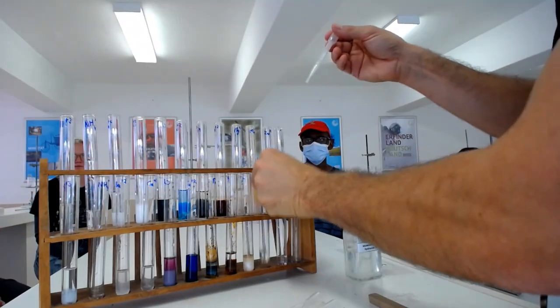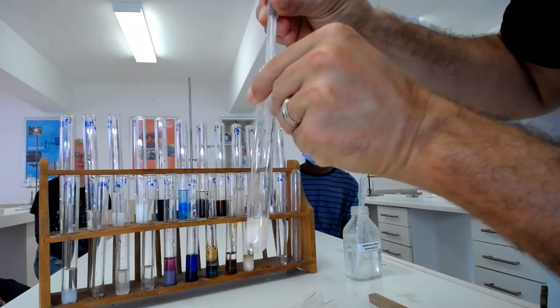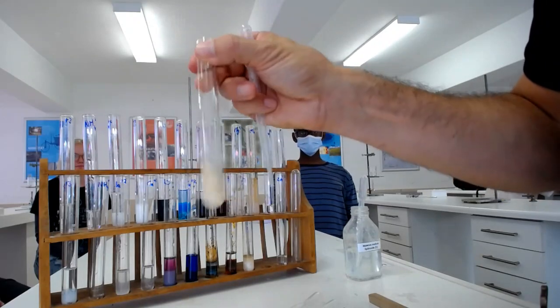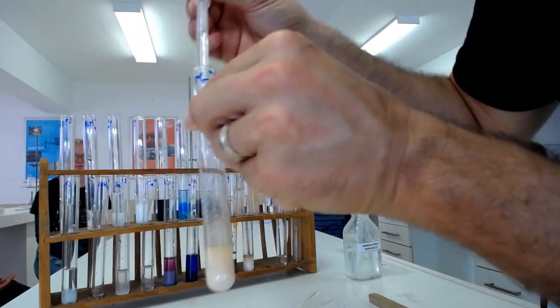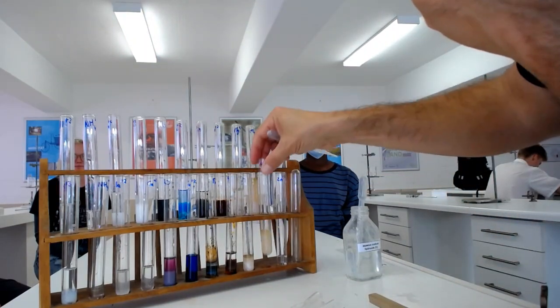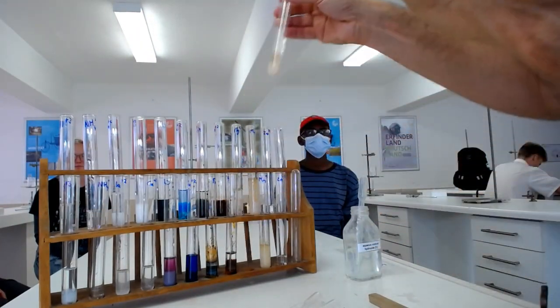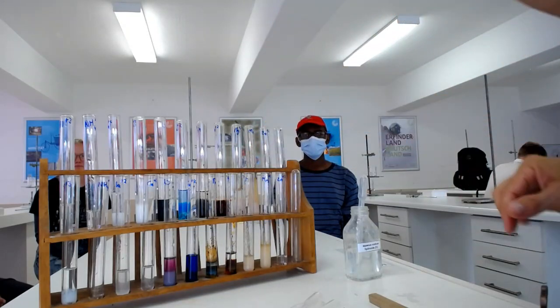Right, and what about ammonia? Let's see what happens in there. Same thing, a white precipitate that rapidly turns brown on top. What about excess ammonia? Also insoluble. So what's the thing about magnesium? I don't know. It says white precipitate insoluble in excess, which is technically true, but it's brown. But it also turned brown. That's weird. Could have messed it up.